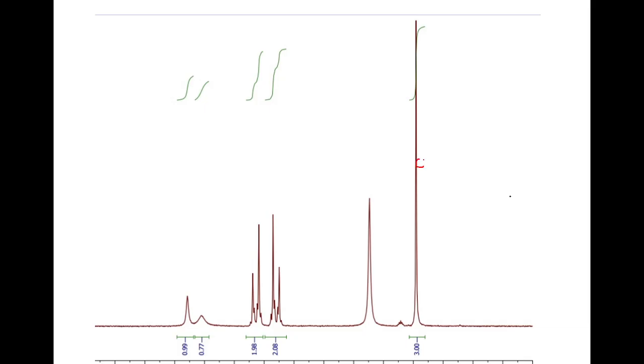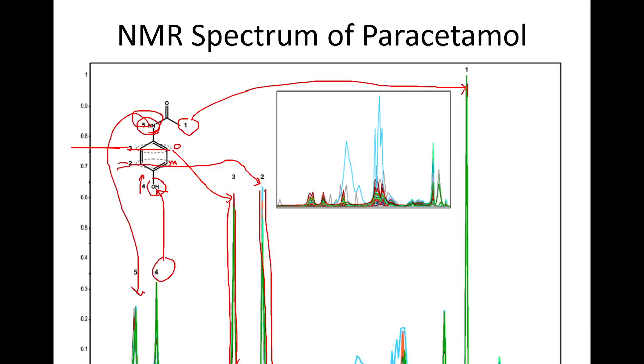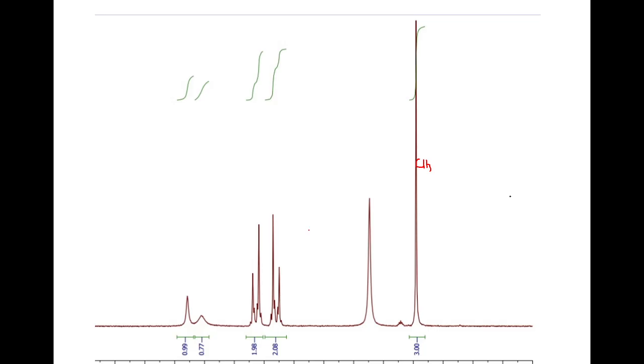We get CH3. Okay, you go back, and this one, okay, now look at this here. Interesting. The OH is now gone into here, is less deshielded than the benzene ring. Now, the effect of this is because of the magnetic field.